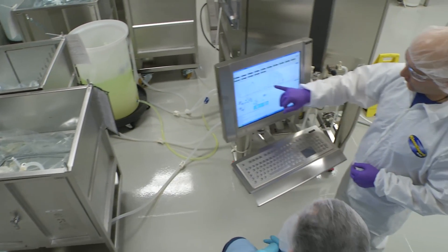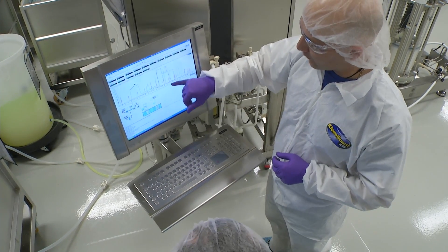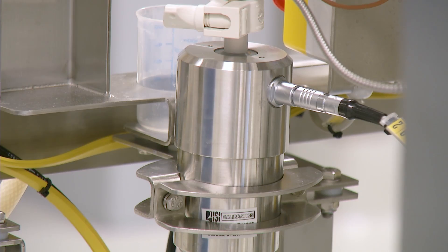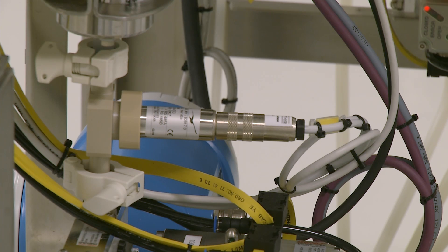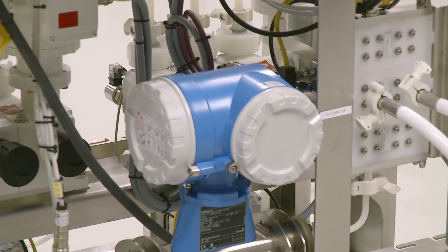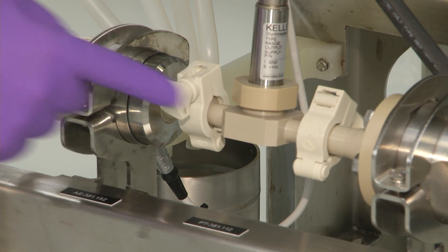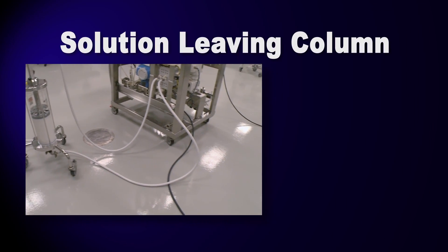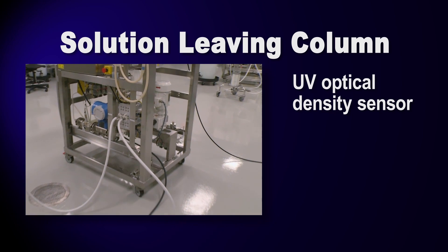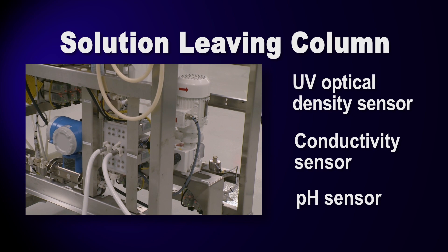To help monitor the chromatography equipment and the solutions flowing through the unit during the process, a number of sensors are located along the product flow path. There is an electrical conductivity sensor at the column inlet, a pressure sensor just before the pre-filter to help identify a filter clog, a flow meter to measure the rate of solution movement through the column, and an air sensor to ensure that no air has entered the flow path. As a solution leaves the column, it passes a UV sensor that reads optical density, a second conductivity sensor, and a pH sensor that measures how acidic or basic the solution is.